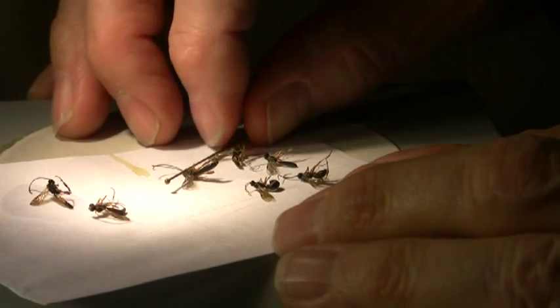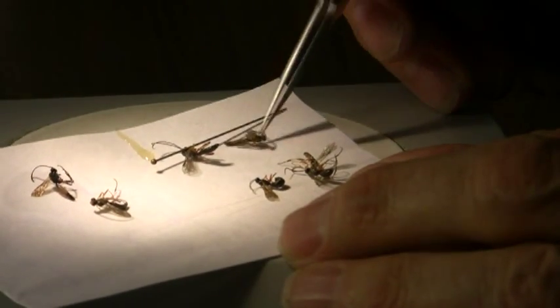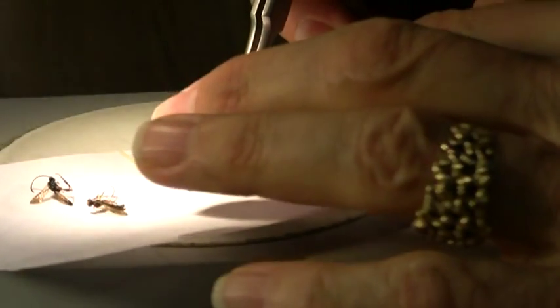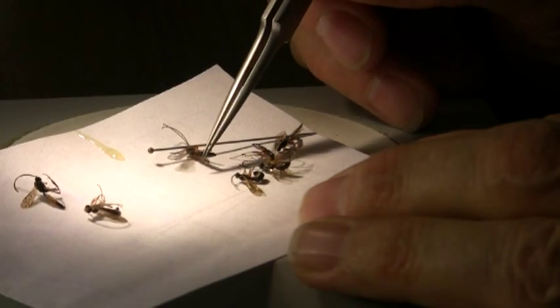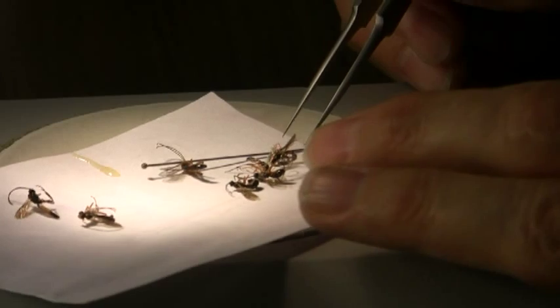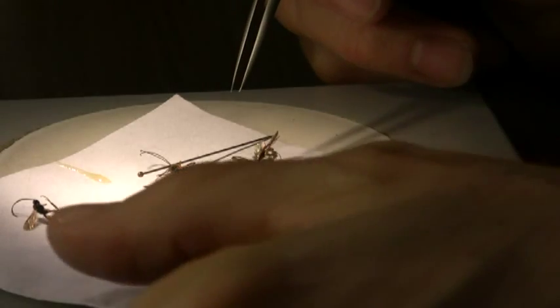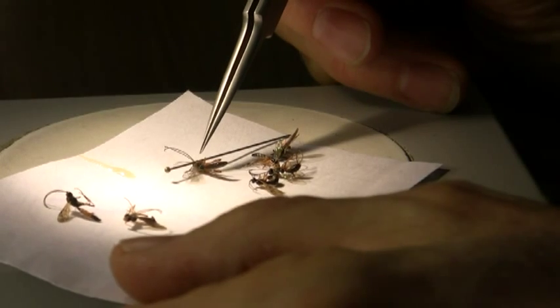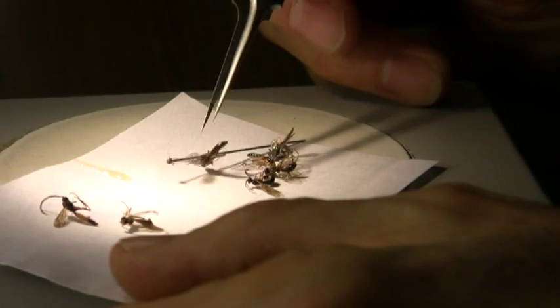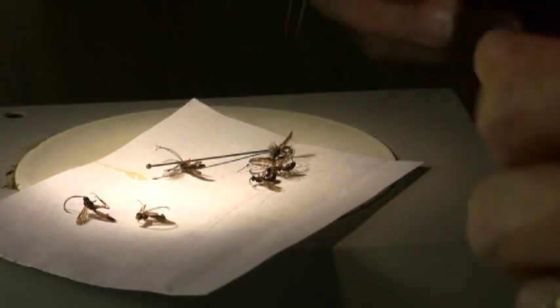Now what you can do is set it on the specimen, move it around with your forceps until you get it in a nice position, ideally right on the side of the thorax, and in nice vertical orientation, and then let it sit there for just a few minutes before you actually pick it up. This will allow it to get sticky and tacky on the pin. Try to keep your forceps out of the glue.